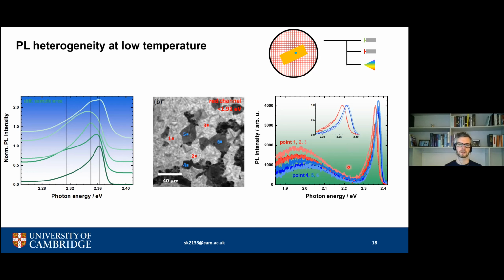At the point when we looked at this first and we published that last year, we proposed that this was due to defects, so certain crystallites having more defects than others and a certain type of defects. However, there was also a line of literature that proposed there might be differently stacked inorganic layers in here. So usually you have the layers stacked parallel to your substrate surface. They could also be stacked vertically. We didn't see anything in XRD, so we favored the former, couldn't, however, really exclude the stacking.